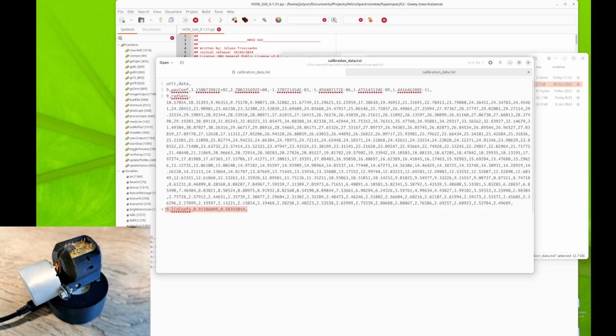Also then you have the linearization coefficients. So the sensor tends to be quite linear, although that linearity breaks near the 0 point, so near the dark measurement, and actually that becomes quite problematic for some scenes with lots of dark stuff going on. Or darker parts of the spectrum, I should say, rather. So that's quite easy to work out, though, and that can be worked out per unit quite easily.